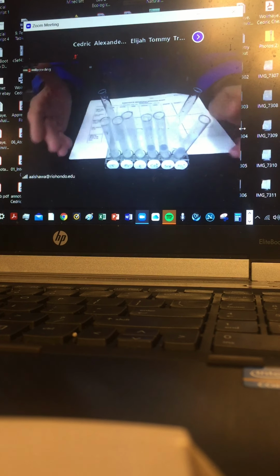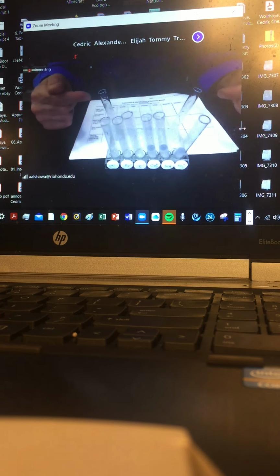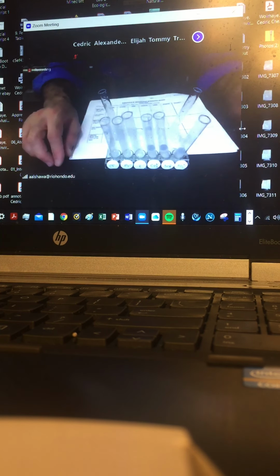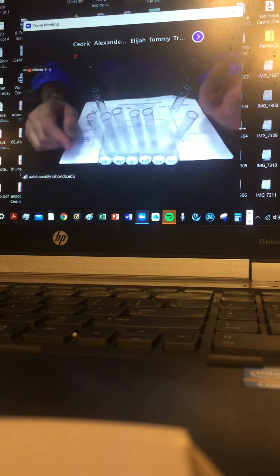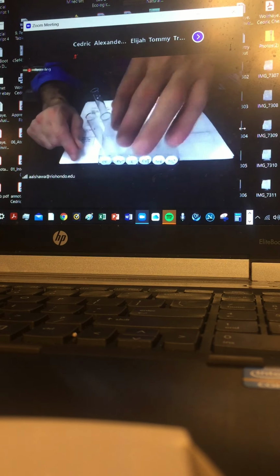So it becomes an exercise of more than an hour or so of cleaning all these test tubes and making sure there are no remnants, no impurities, nothing remaining of the previous runs and tests and ions. Once you have slight contamination, the tests would not give what you anticipate. The results would not be true. So one of you will be busy for 1 hour washing and cleaning the glassware. That becomes the exercise for the day.